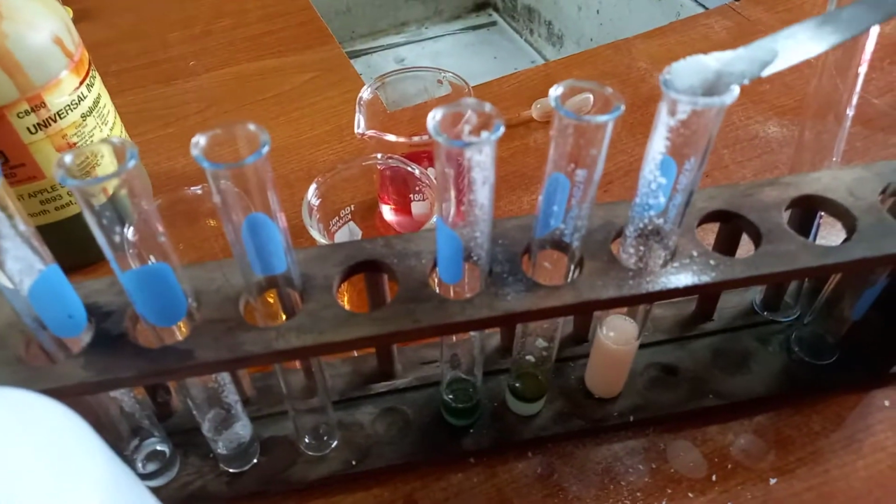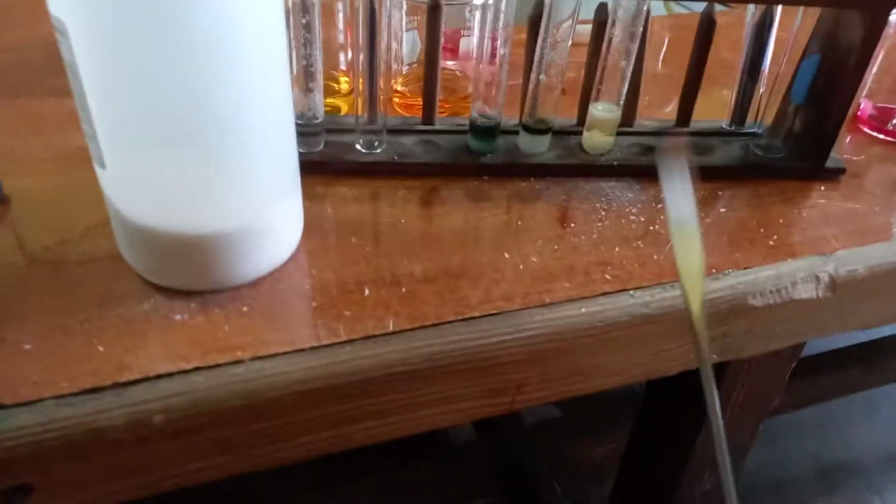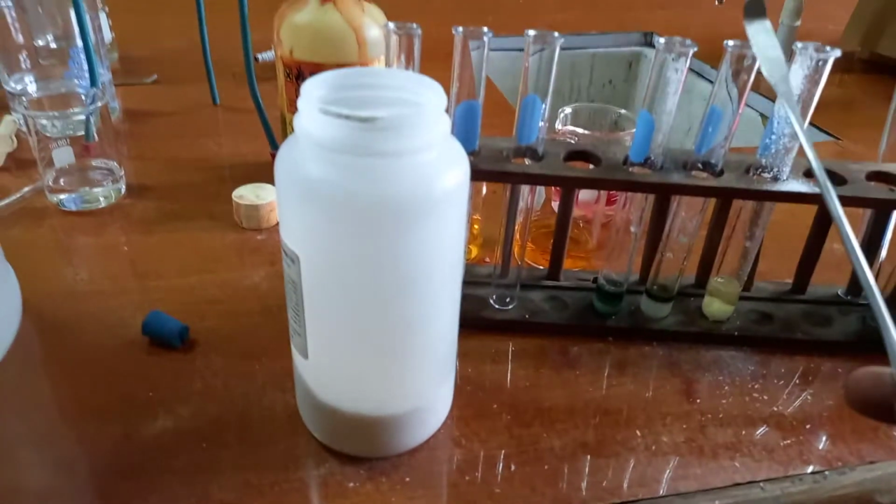Let's go again. This is very concentrated. So as you can see now, it has changed from orange, so we are getting closer to green. So I'm just showing you, right? It would have eventually changed to green when all the acid had reacted. But clearly we can see that this one is the acid, right? Because it reacted like the acid.